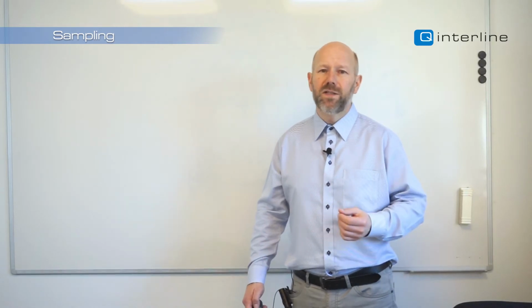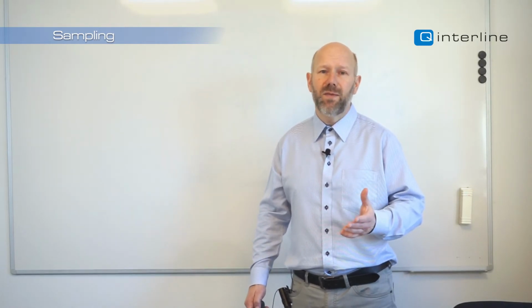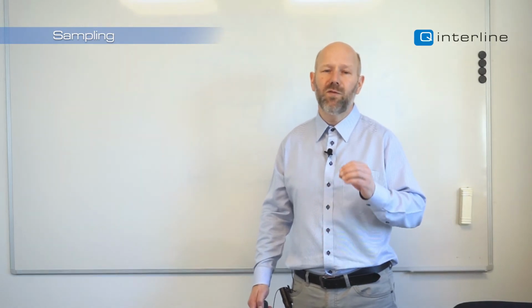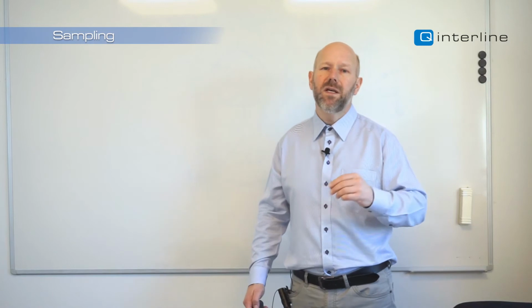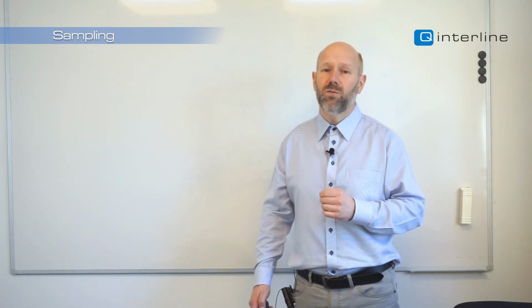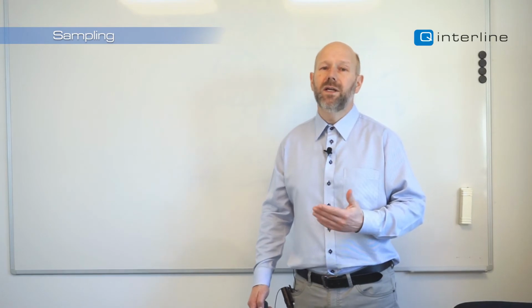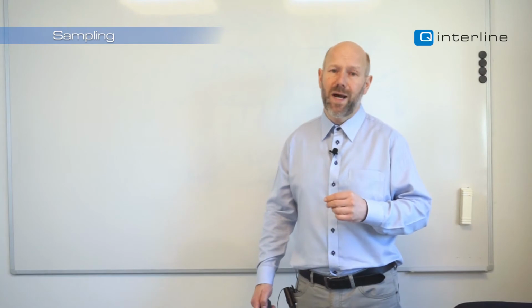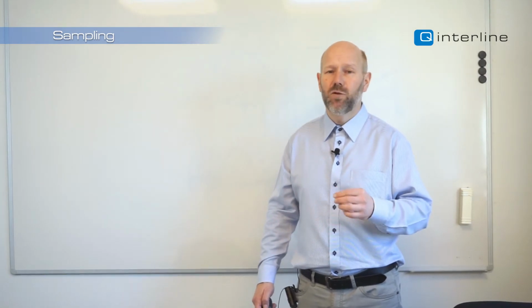What is spectral quality? Well, spectral quality, in my opinion, is a low noise spectrum that contains all the needed small features, shoulders and peaks, allowing us to build the application that we want with the required accuracy, agreement, precision, and not biased. That's good performance.